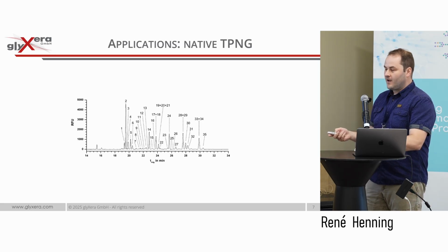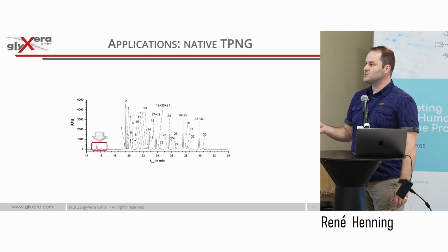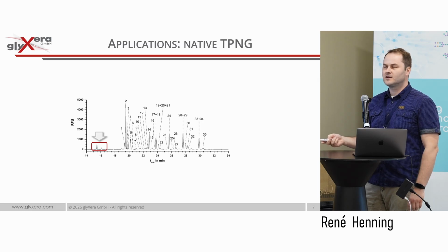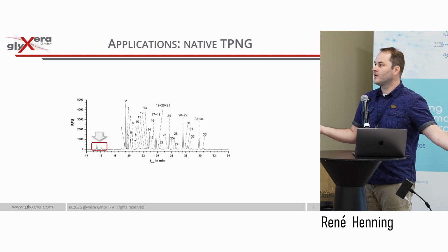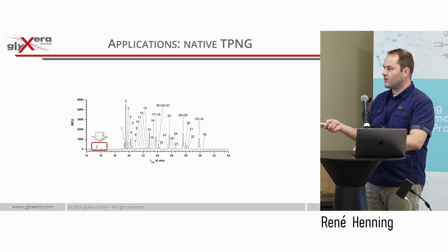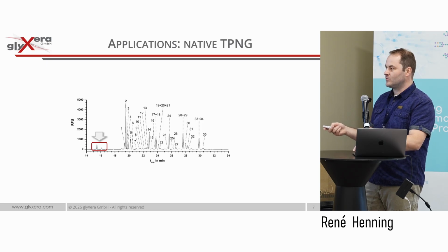But the important thing here in the beginning: we actually displayed it in the initial publication. Later on in this publication, you did not see this first part of the electropherogram anymore. There were also some peaks, and we did not exactly know what they were, so there are also no numbers on them. We knew these needed to be N-glycans because APTS, the label we are using, is specific for glycans, so it's not monosaccharide. The glucose is coming here quite early. It needed to be some N-glycan, and due to where it's migrating, it needed to have a lot of charges.